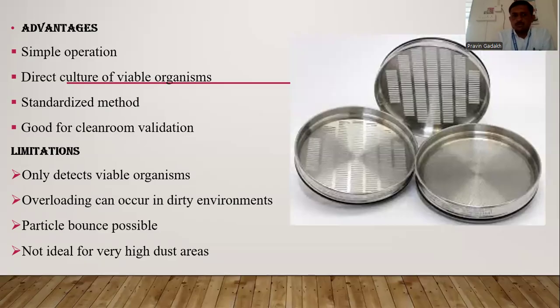What are the limitations of this method? It can detect only the viable organisms which are present in the air. Overloading can occur in a dirty environment, as there is no filter; air can directly enter the metal box through the sieve.